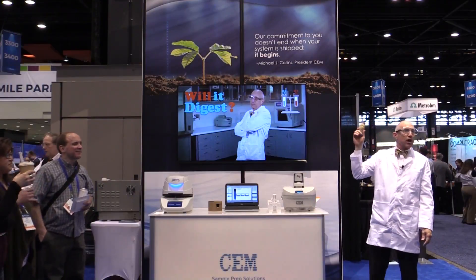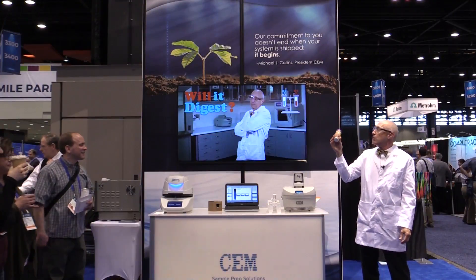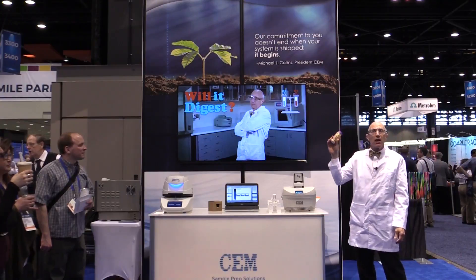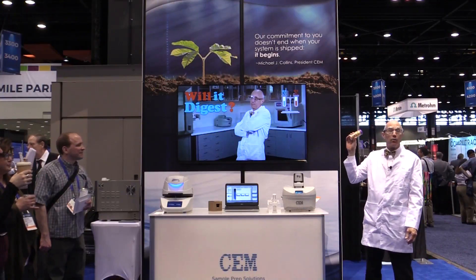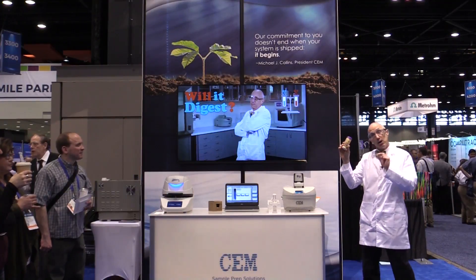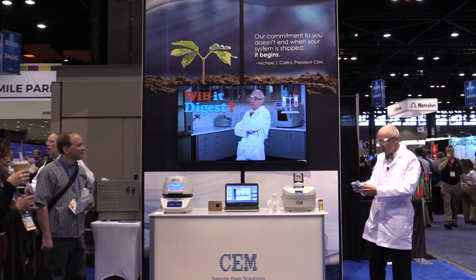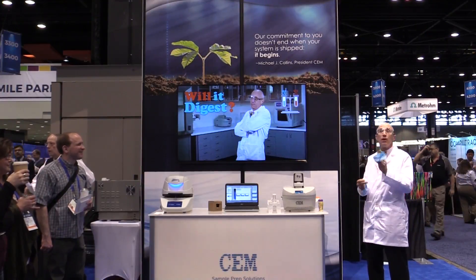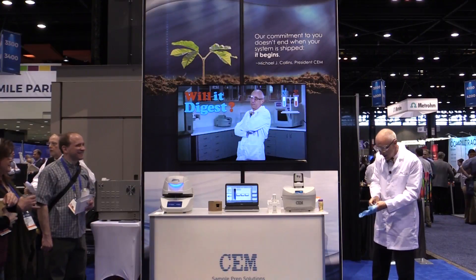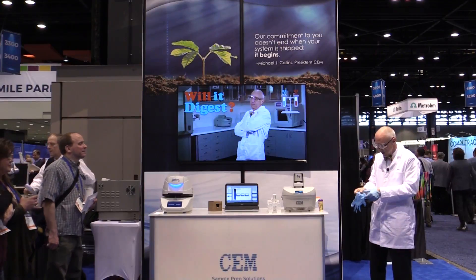So that's what we're going to do. I'm going to go into the remote lab here and set up the cheese powder in the microwave system. Then I'll take a quick run through on how to reconstitute the dry powder so you can get a representative sample. Before we get started though, we've got to do the one thing — gotta have a little safety. You don't want to see me with yellow fingers coming back out. So let me get my gloves on and then we're going to head into the laboratory.